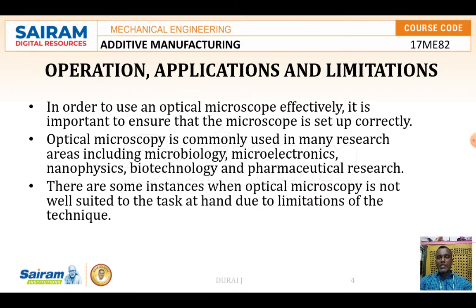Okay, everyone, while seeing the microscope, we can see the things we require. It can be fast and adaptable for all kinds of sample systems, and it is easy to integrate with the digital camera system, data storage, and other analysis. So these are all the advantages of the microscopic device. Then comes the limitations.